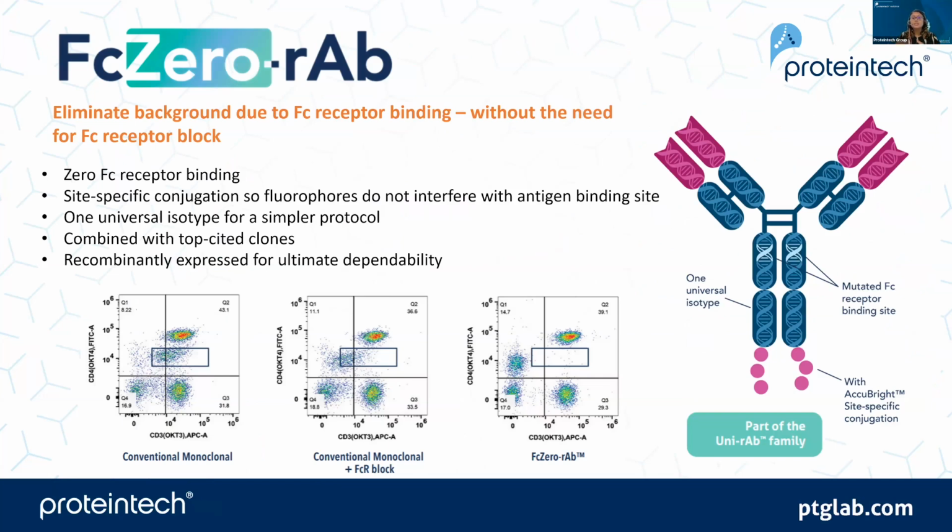A lot of immune cells, especially things like monocytes, express Fc receptors. And unfortunately, the antibodies that you use for your flow experiments have Fc receptor binding sites. Therefore, your antibody might be binding to your protein of interest, or hopefully it is, but it also might be binding to the Fc receptors and causing a false positive signal. To get around this, we generally use an Fc receptor block to mask these binding sites from your antibodies. But Fc receptor block not only lengthens your protocol, it also doesn't completely get rid of that false signal.